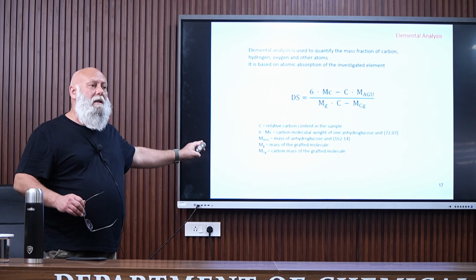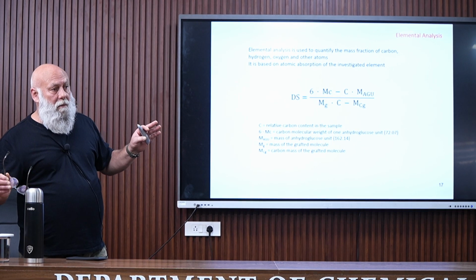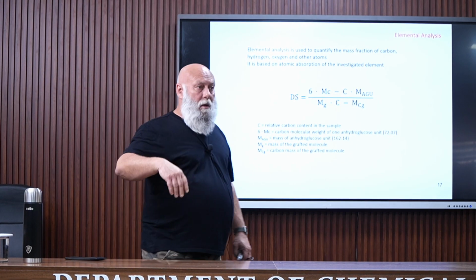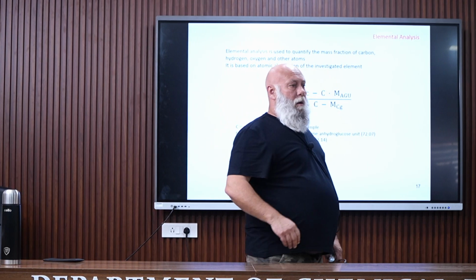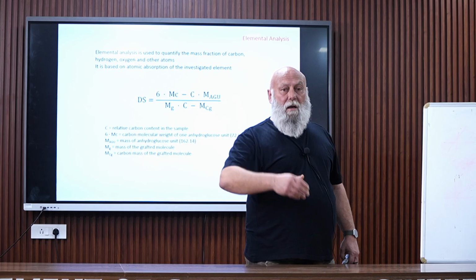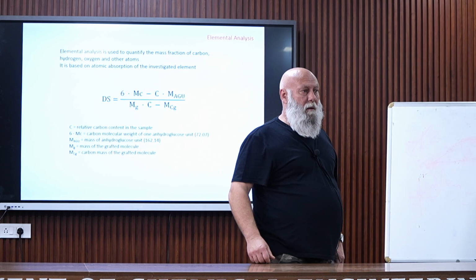It's quite an easy technique. It's not available in, for example, Grenoble; we don't have this elemental analysis. We send the sample to a lab which is specialized in this, and they receive samples from the whole of France and perform the experiment.